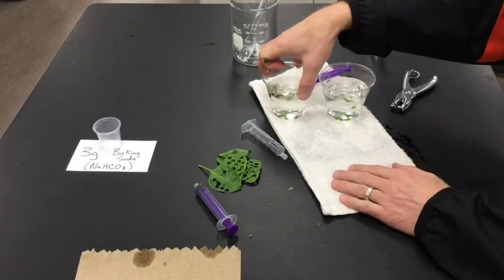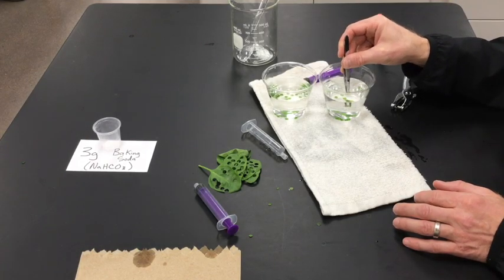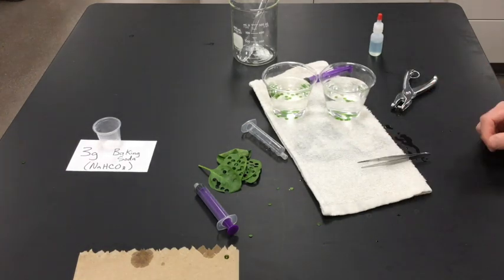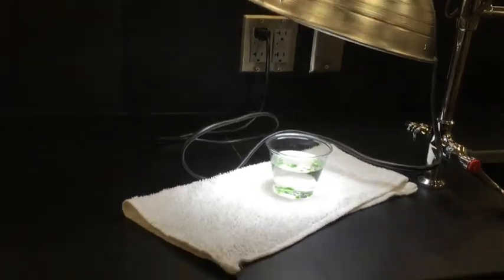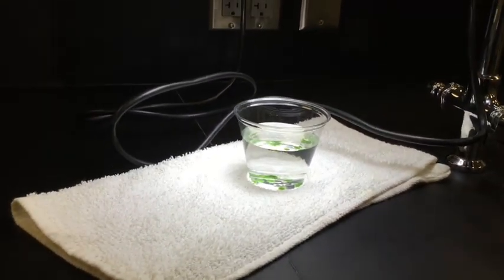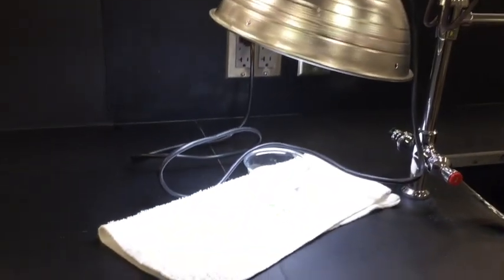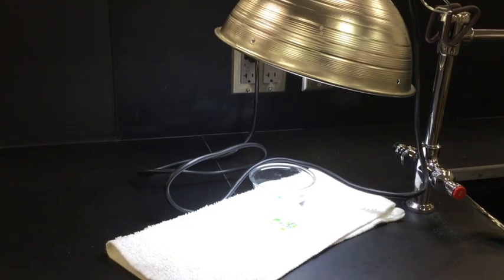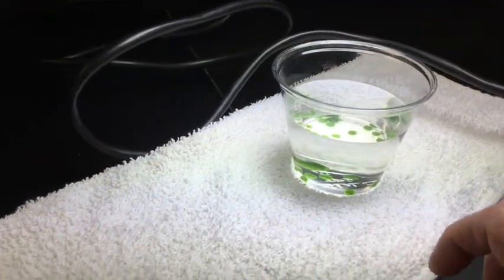They should all be at the bottom to start the experiment. If any are floating, remove them. Then I put one cup under a light condition and one under a dark condition — the dark one goes in a lab drawer. Over the next 15 minutes, I'm going to record how many float every minute and check how many have started to float.